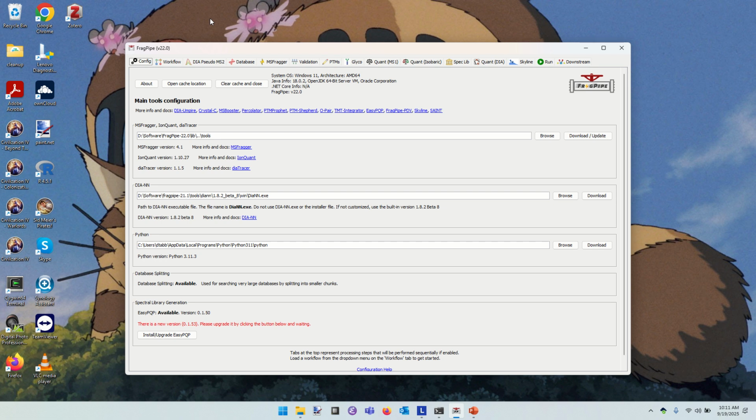We have some software tools for Python. Python and Java are the two principal languages in which the FragPipe tools are encoded. So we need to be able to have a reasonably up-to-date Python, but not too up-to-date in this version where the software won't work anymore. It's crazy. So I'm really glad that Python is now installed for you when you install FragPipe.